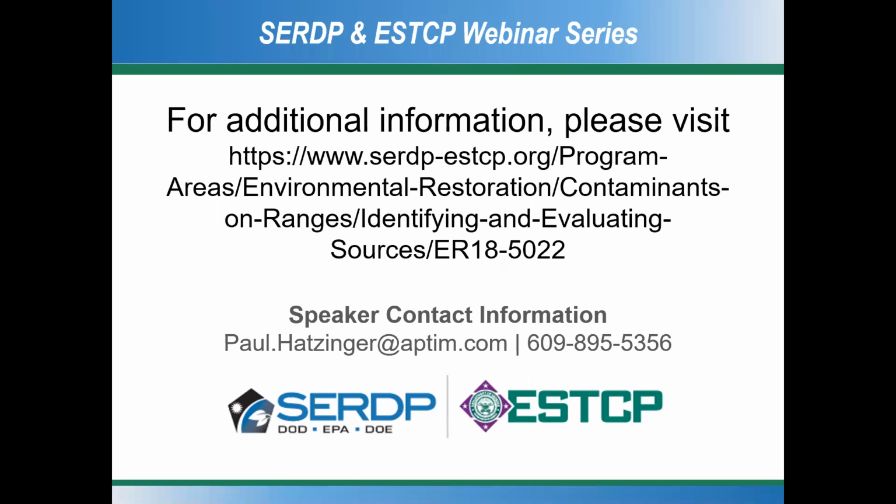I'll end there. For further information, please visit the SERDP ESTCP website. Clearly there's been a huge effort put into developing CSIA techniques. There's a lot of different really good researchers who've done this. A lot of it's funded through SERDP ESTCP, and these techniques are available commercially. There's a lot of university lab people as well as government people who are more than willing to talk to you and help you out in terms of interpreting data. How do you sample? How can these techniques help you?